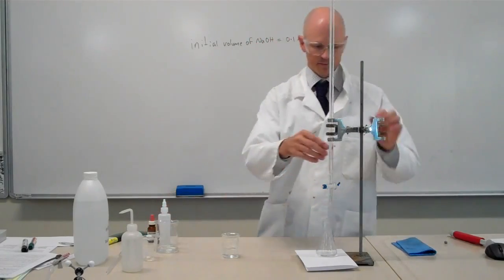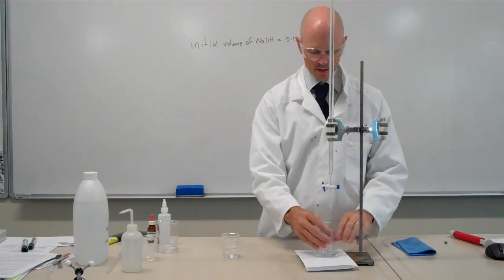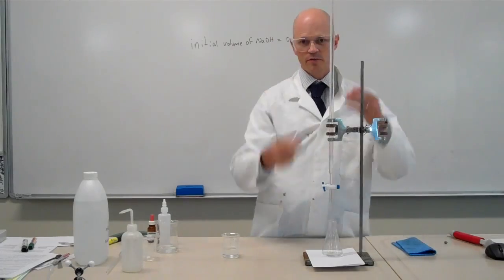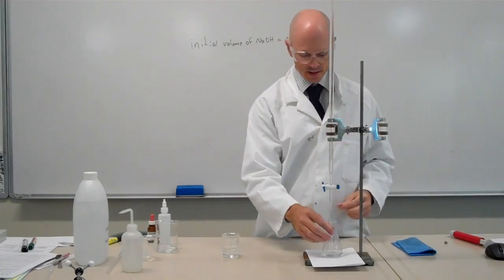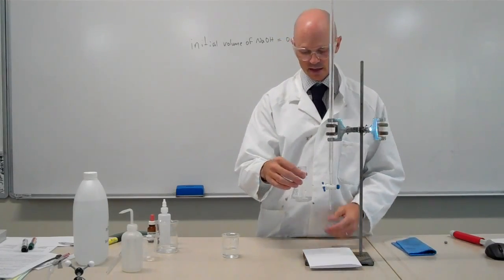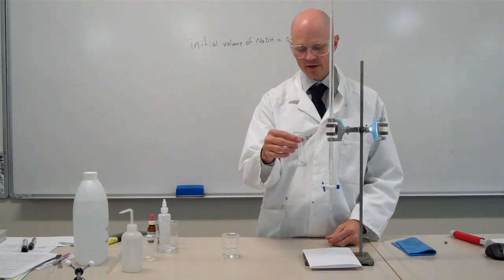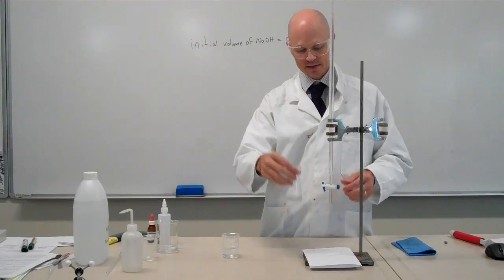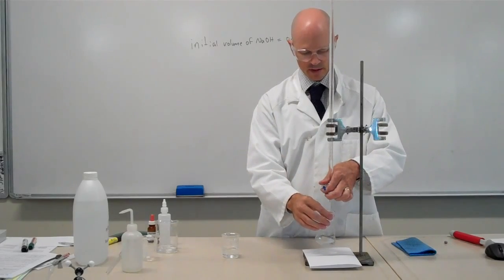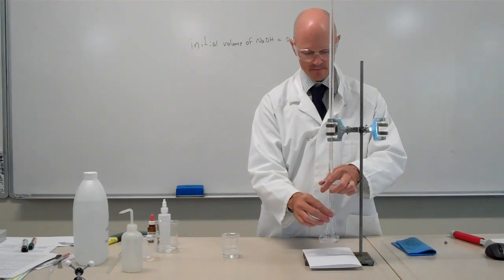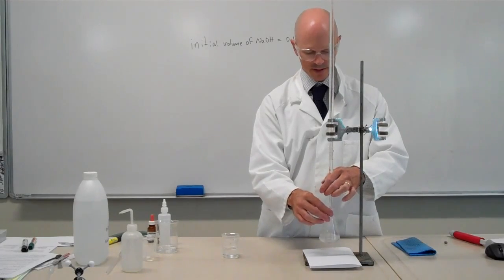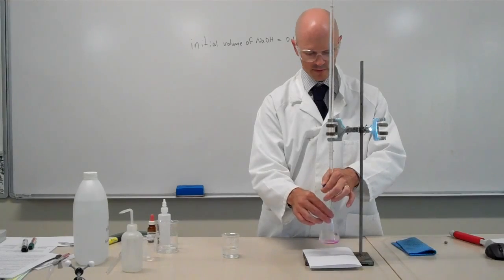The process now is to add the sodium hydroxide from the burette into the flask containing my vinegar until we have a colour change. Phenolphthalein changes from clear to pink when it goes from acid to base. So I'm just adding my sodium hydroxide by opening up the tap and just twirling around.